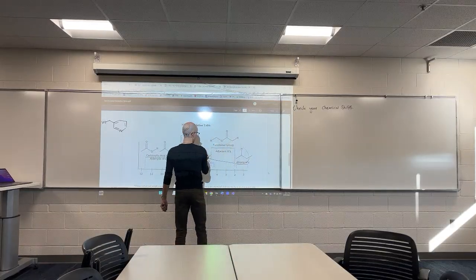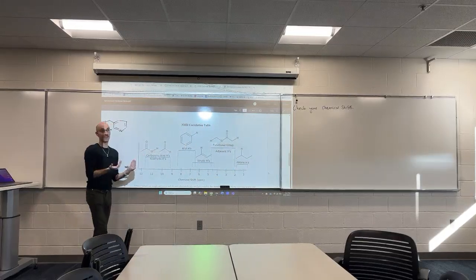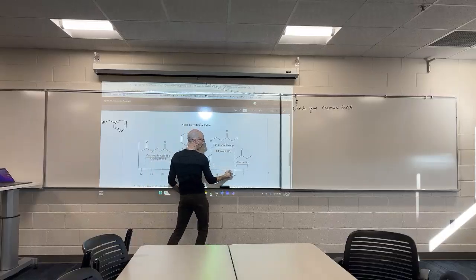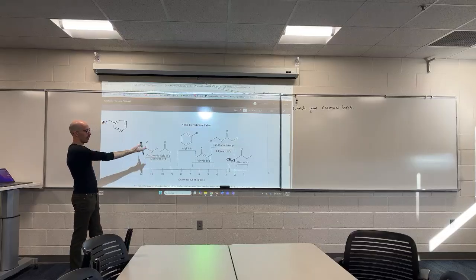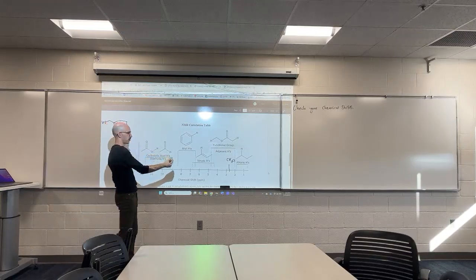With that one that's connected to the two functional groups, is that a situation where there's that compounded effect that we were talking about? Exactly. So would you expect to see it pretty far down because it's two functional groups, or not? It's a good question. For example, the hydrogen signals from CH3Cl, chloromethane, show up about here on the right-hand side of the functional group adjacent range.